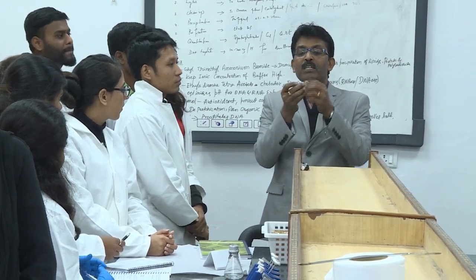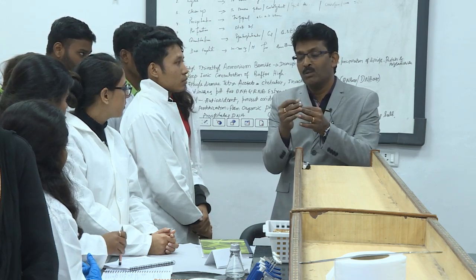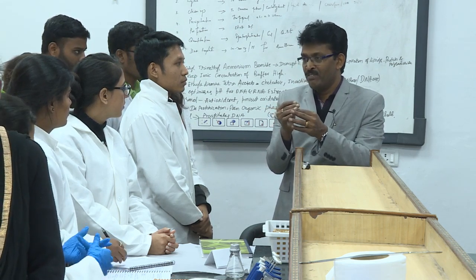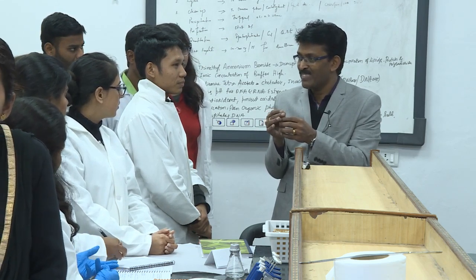these 2 are from the same sample, correct? It's only 2 replications. So you gave 0, 1 and 2. Now what you have to do is you can change the label now. Don't use the label 1 and 2. You create a kind of code by which you can understand what you are handling. Because 1 and 2 is something which you cannot remember all the time, right?